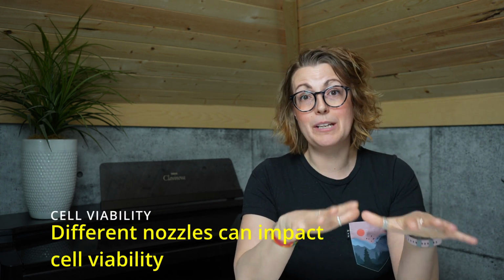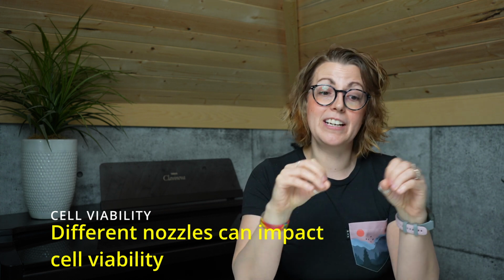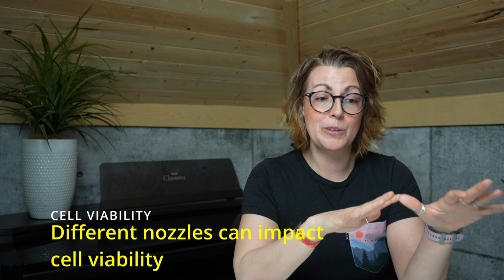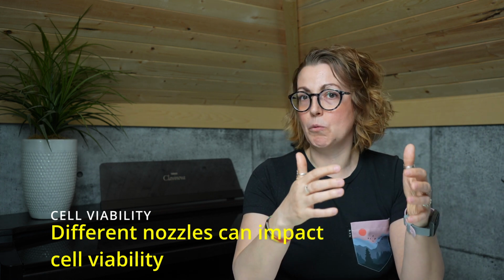Nozzle size can really impact your cell viability. Smaller nozzles can generate higher shear forces that may damage cells. Smaller nozzles also run at a higher pressure, which we'll talk about shortly. This can also impact your cells, especially if dealing with sensitive cells.